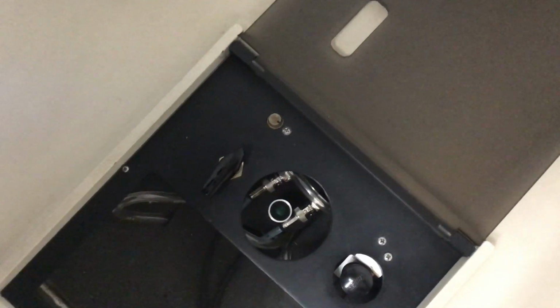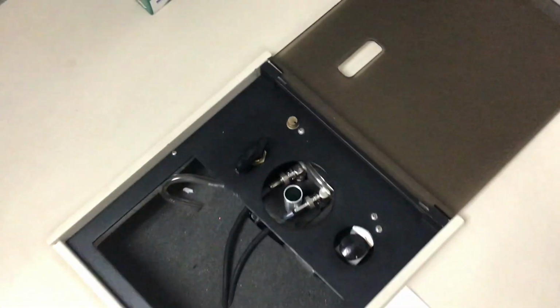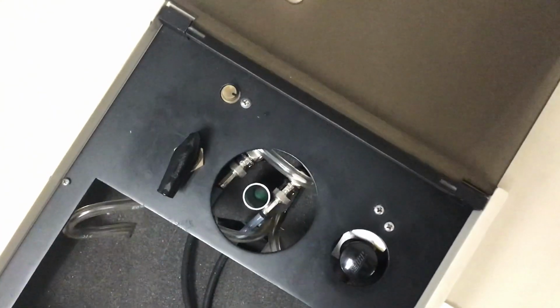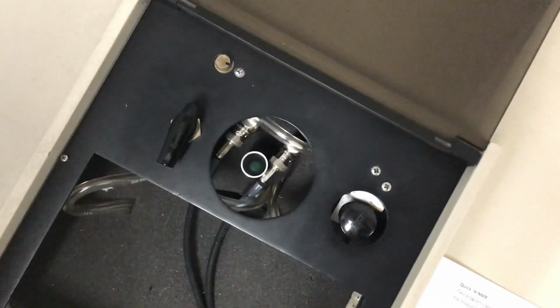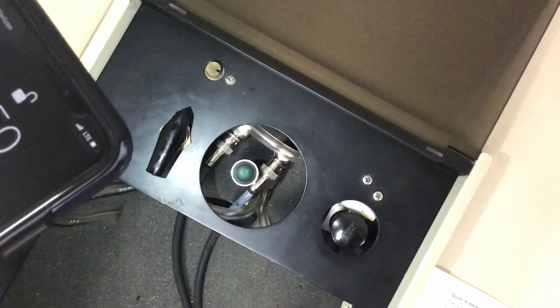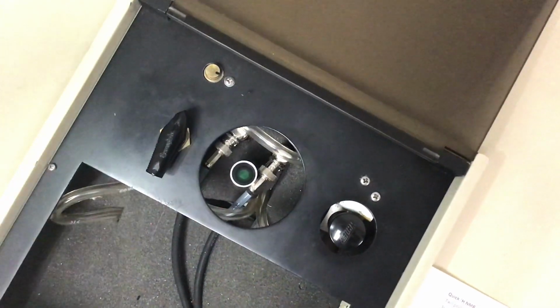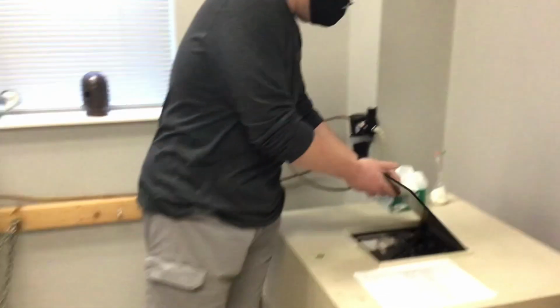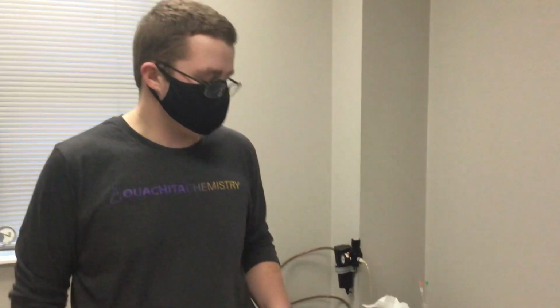Now, at this point, you'd probably need to grab a flashlight or something to look down into the tube. You need to verify that the tube itself is spinning, and that's why I said it'd be good to mark the top of it if you haven't already. If you look on the inside, it may be hard to see on the video, but it is spinning rapidly on the inside, which verifies that it's doing exactly what it's supposed to do. The sample's ready to be taken. The measurement is ready to be taken, excuse me.